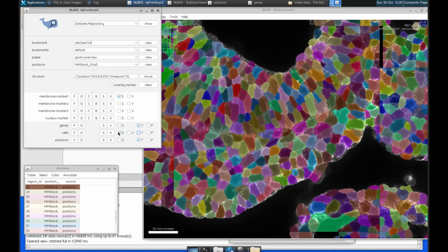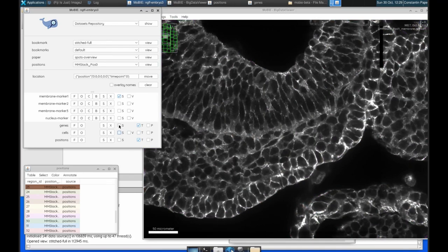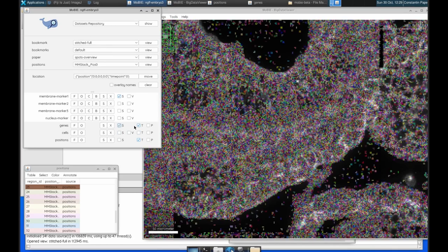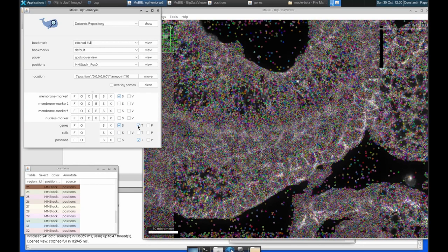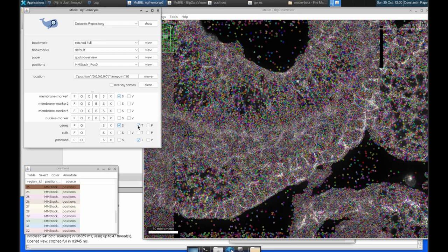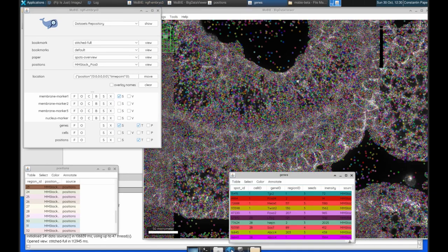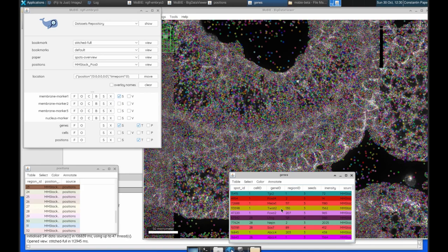The next layer we have is this genes layer. So these are the individual spots. These are decoded genes from the spatial transcriptomics readout. And by default, they are coloured by the first column in this table, which is the spot ID. So these are just arbitrary IDs that identify each spot, and they have no biological relevance.